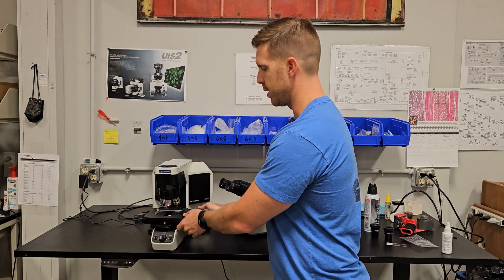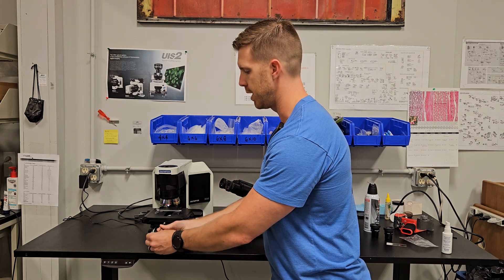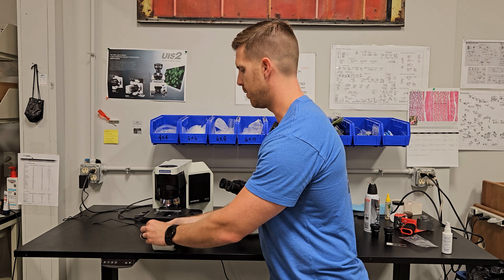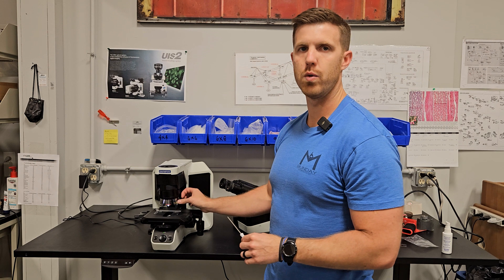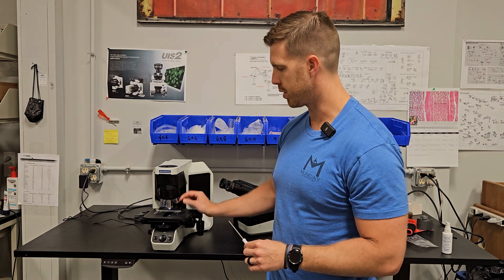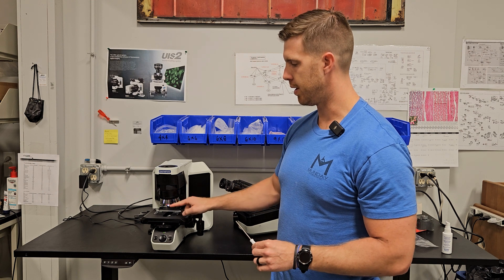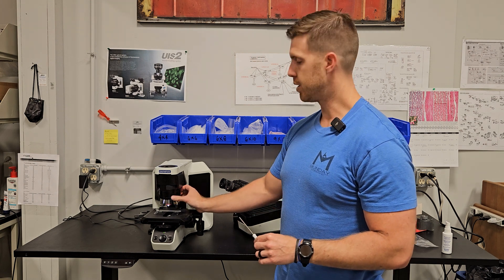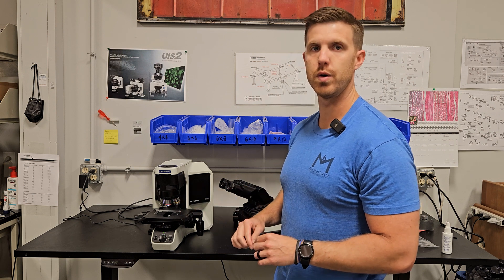You're going to want to make sure the focus is all the way up if the objectives are on so you don't hit them when you're putting the stage on. Lock it on down. These objectives can be moved in whatever orientation you like. Most folks go from the 2, then turn it like that — 4, 10, 20, 40. Some folks like to go the other way, so you can feel free to move the objectives to whatever orientation you like.